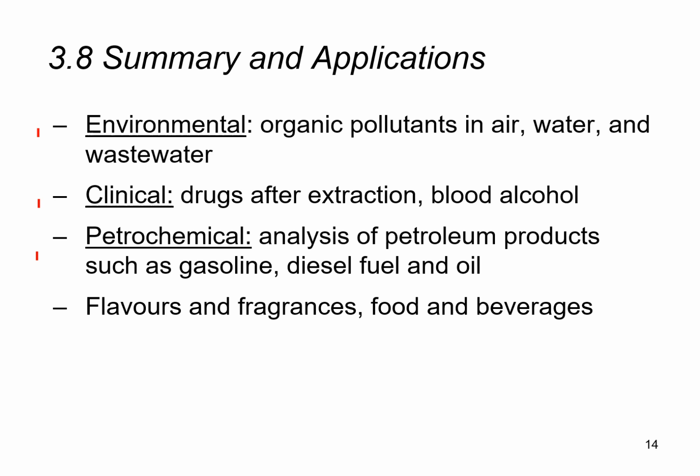So again, I would recommend that there's no real need for us to memorize these applications, right? The point of this slide is that gas chromatography can be applied to a wide variety of applications across many different industries. So that brings us to the end of the gas chromatography topic, and I hope it has been an enriching topic as we close.